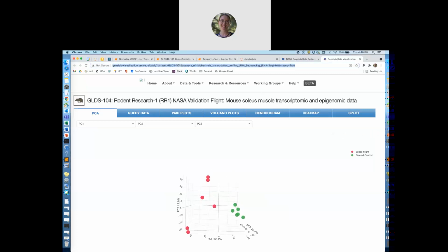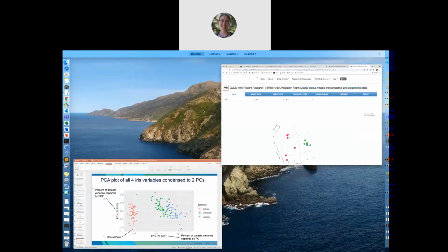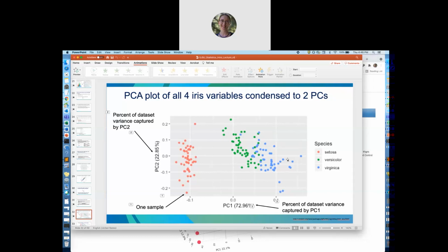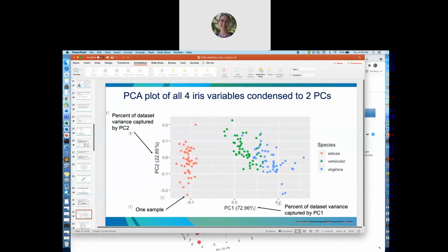Can I put this link in the chat maybe? Yeah, for sure. All right, if you guys want to play around with that 3D plot a little bit more, I just put the link in the chat. All right, and thanks for the clarification, Kevin. Appreciate it. Any other questions or thoughts on PCA?